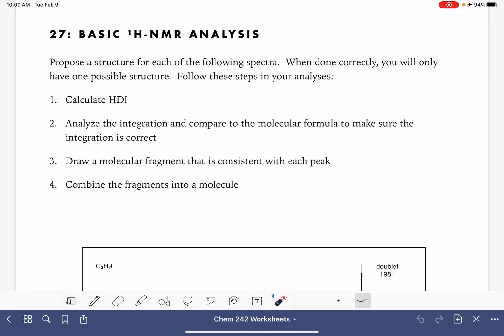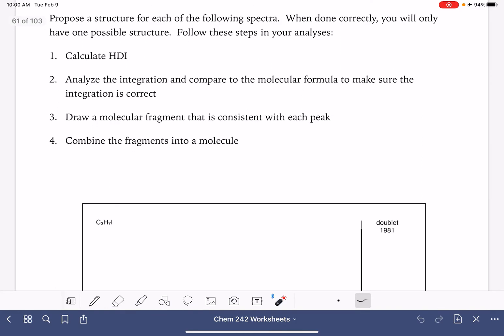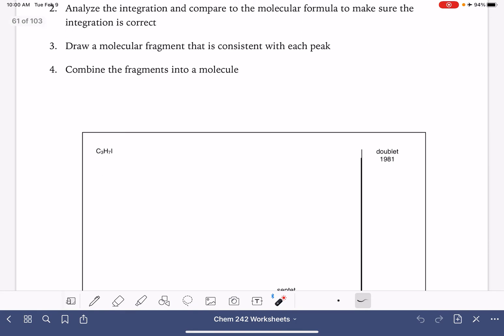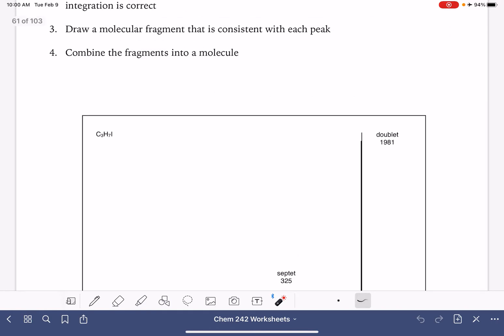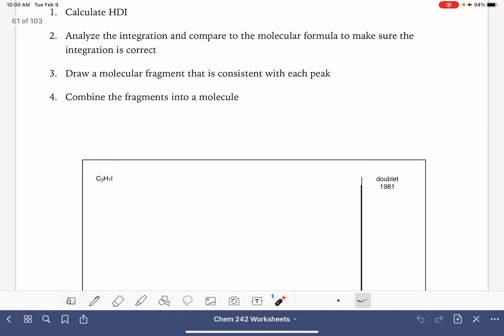On this worksheet, we're going to do some basic NMR analysis. We are going to have a proton NMR spectrum along with a molecular formula, and we're going to use this information to determine the structure of the molecule.